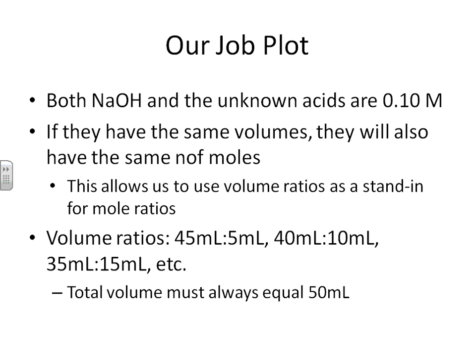Now, the specifics of the Job plot that you will be creating. First up, I'm telling you right now, the sodium hydroxide and the unknown acid, both of the unknown acids, I am telling you they are all 0.1 molar solutions. This is going to be critical for us because the whole point of the Job plot is finding the correct mole ratio. If you don't know the formula of a compound, you have to know something about its concentration. You have to have a way of controlling something about its concentration so that you know you're getting the actual mole ratios when you're doing your analysis.